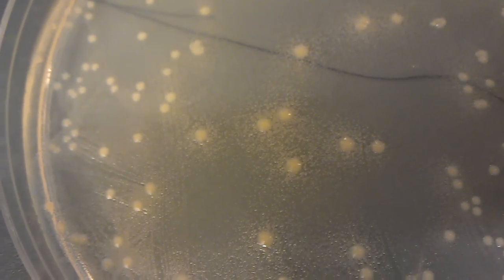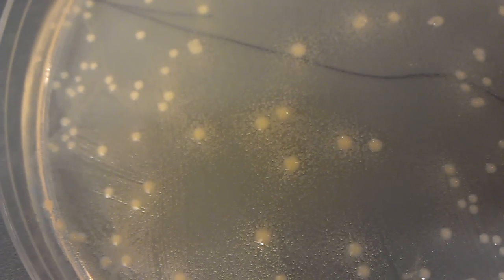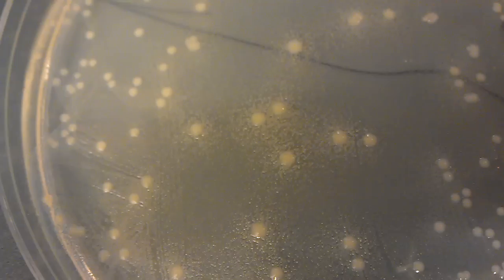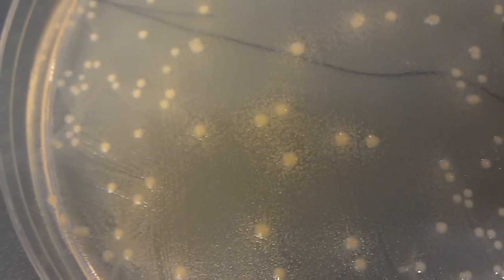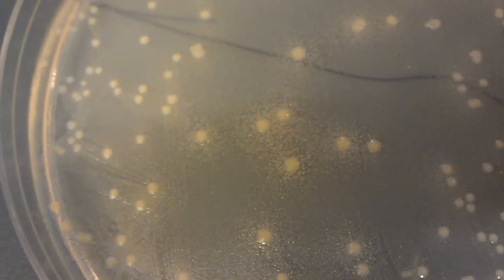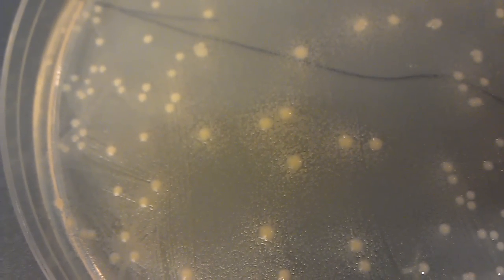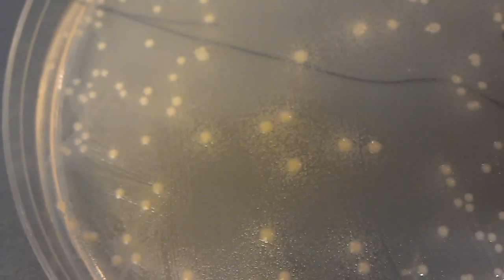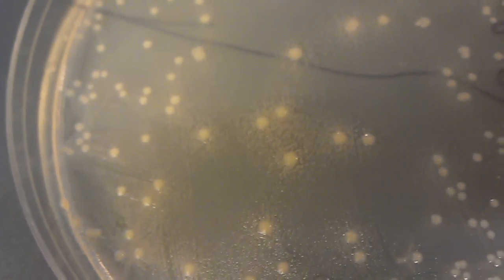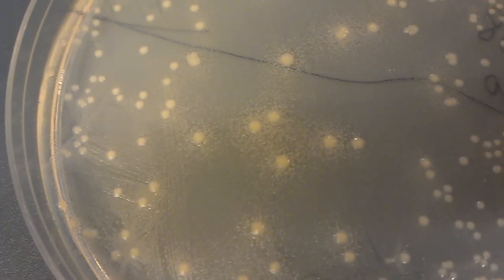and that actually creates a little halo of no ampicillin, or like a little, what would I call it? A low ampicillin area around them, and in that low ampicillin region, you have maybe a few slow-growing cells that grew too slow to get killed off by the ampicillin, but now the ampicillin concentration has been reduced by the central colony, and these slow-growing cells can then grow up and create these little satellite microcolonies, and they're a big reason for contamination, and you want to avoid them at all costs.